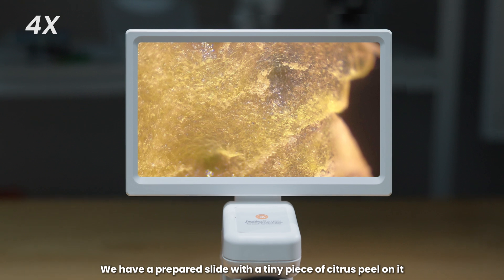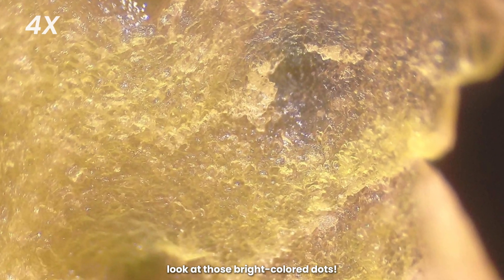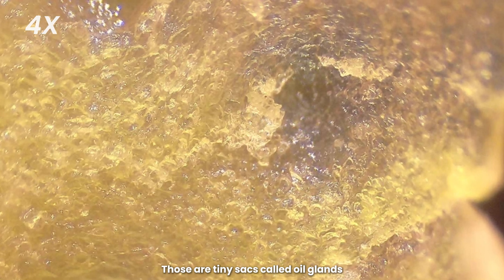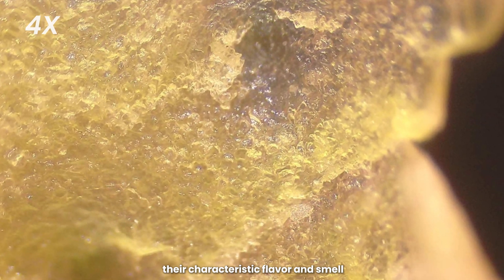We have a prepared slide with a tiny piece of citrus peel on it. Wow, look at those bright colored dots. Those are tiny sacs called oil glands. They contain special oils that give citrus fruits their characteristic flavor and smell.